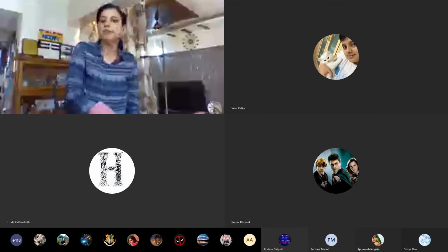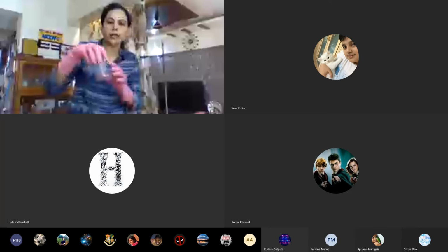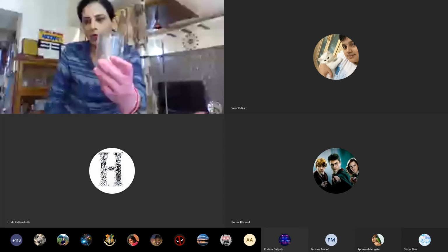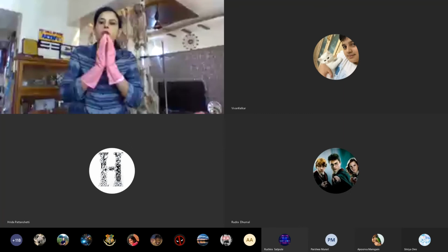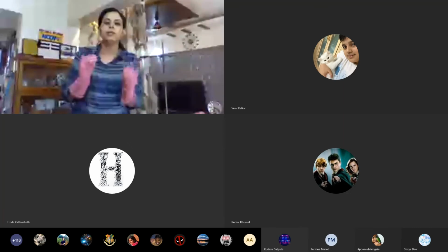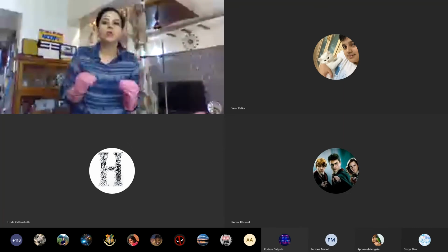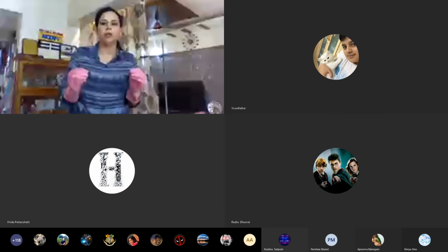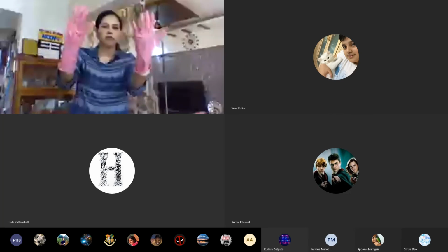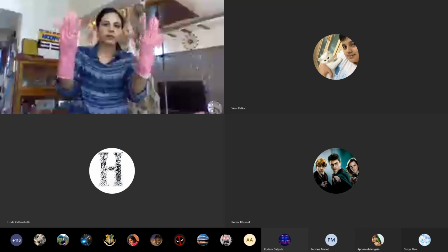And the first thing is, I have a beaker here. This is a beaker. Now very important thing is, whenever you are doing any experiment in the chemistry lab, you have to remember to take certain precautions. First precaution is you have to wear, what you have to wear?